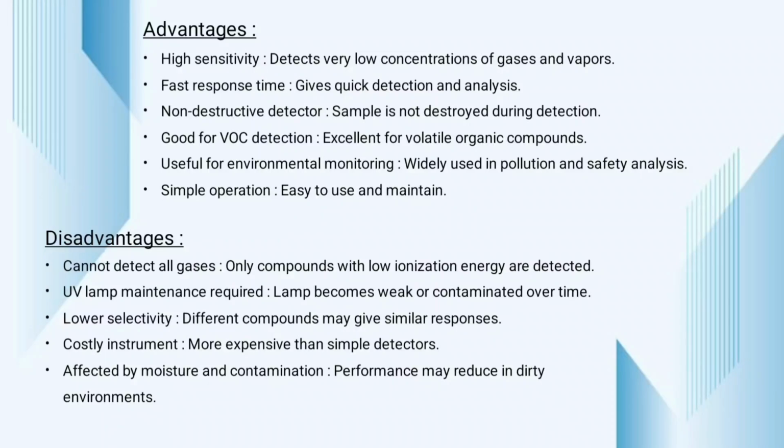Disadvantages: only compounds with low ionization energy are detected. Lamp becomes weak and contaminated over time. More expensive than other detectors. Performance may reduce in dirty environments.